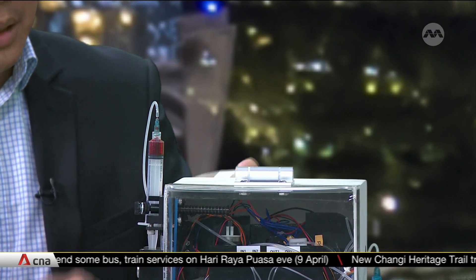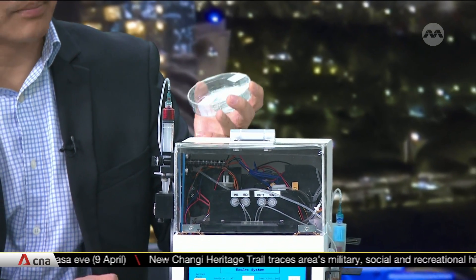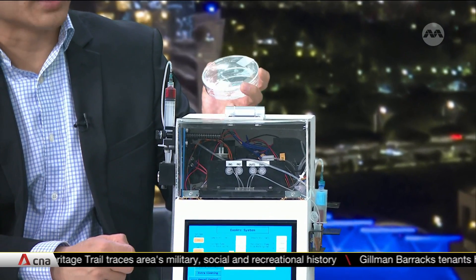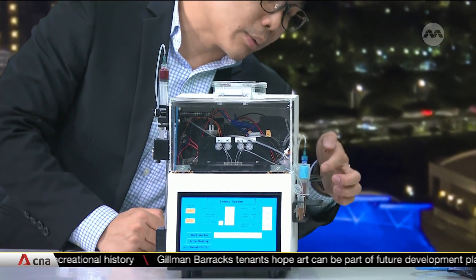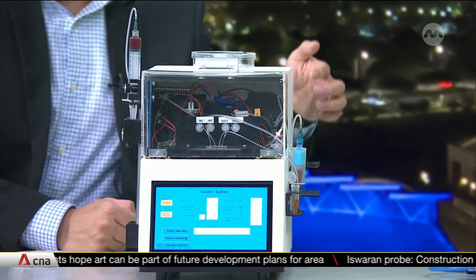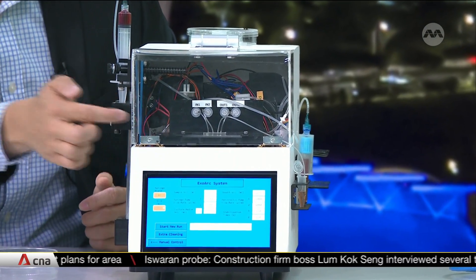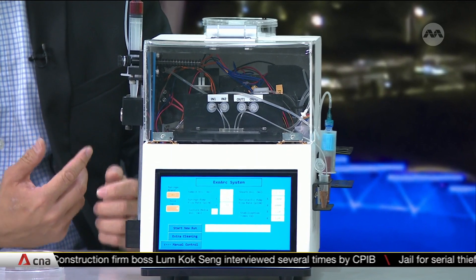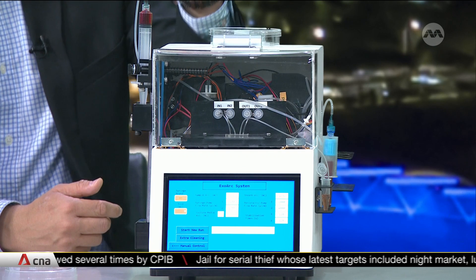This machine you see here is a prototype. Inside this machine consists of pumps and tubing, and what this machine essentially does is automate the process. If you look at this picture here, on this side we have the blood tube. After blood draw, the user will connect the blood tube to the machine, and the device will be placed right at the front. Once they start the program, blood from the blood tube will be drawn automatically and pumped into the device.